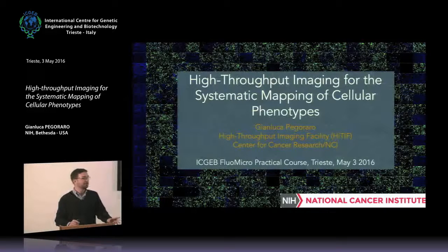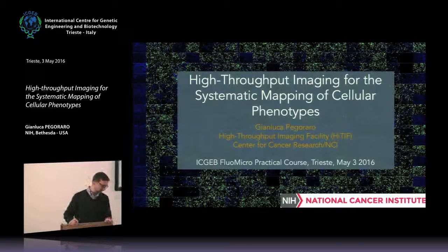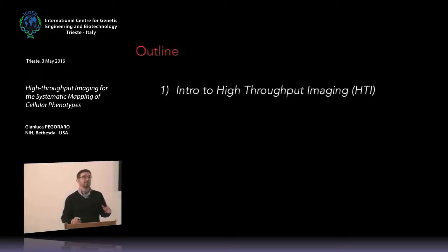I'm not a physicist. I'm a biologist, and so everything that I'm going to tell you today is going to be really geared toward the assay development and the biology more than the technology per se. Having said this, I'll nevertheless start by giving you a very broad and fairly quick introduction to high-throughput imaging.